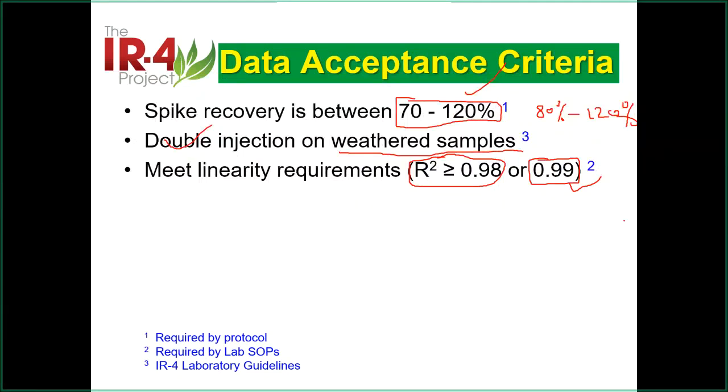If you do multiple residue for not this purpose, not residue purpose, you can probably purchase something specifically for a certain range, where the retention is right in the middle and very close in chemical structure. You can get that as a group. So that's a different question and a different requirement. It's different from what we are talking about today. In that case, you need to validate your method. If that is okay, that should be fine.